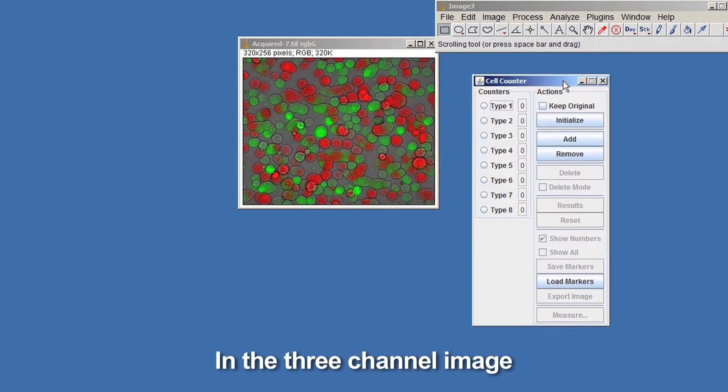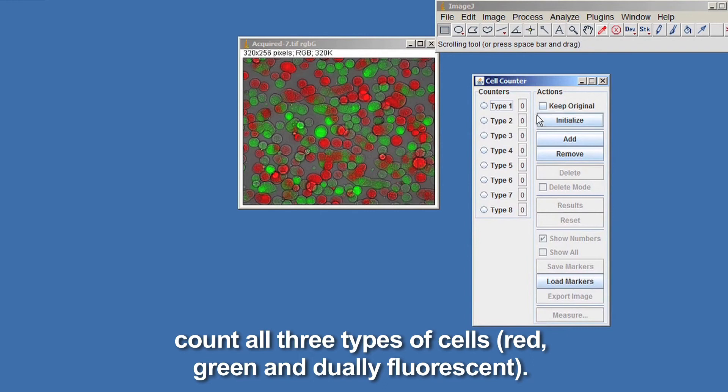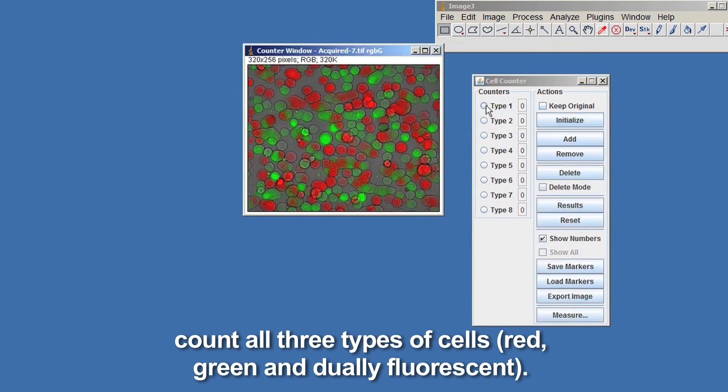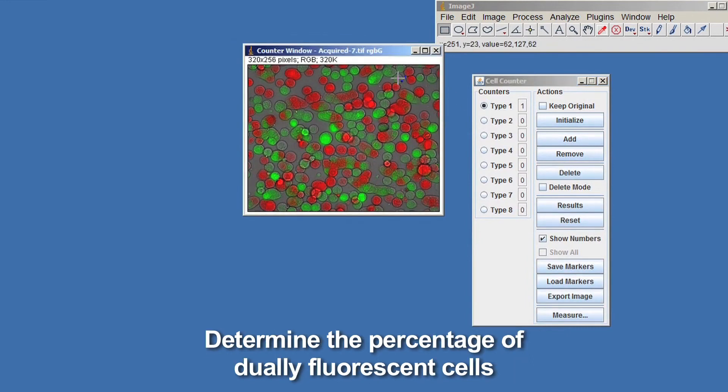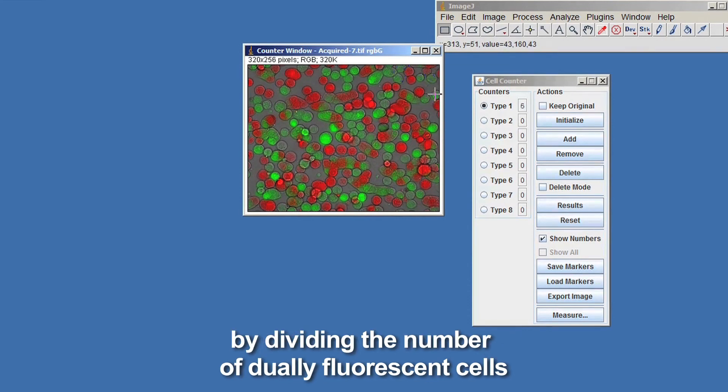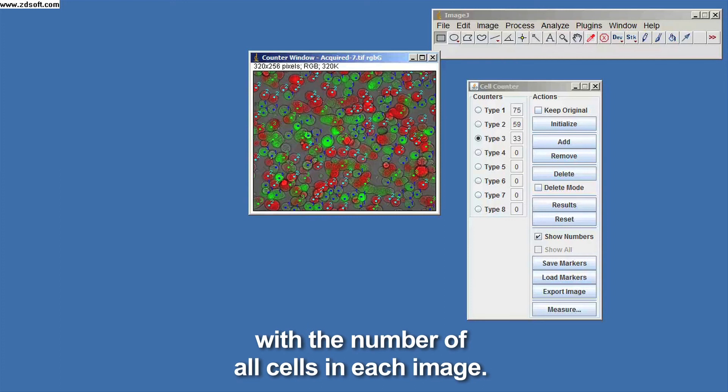In the three-channel image, count all three types of cells: red, green and dually fluorescent. Determine the percentage of dually fluorescent cells by dividing the number of dually fluorescent cells with the number of all cells in each image.